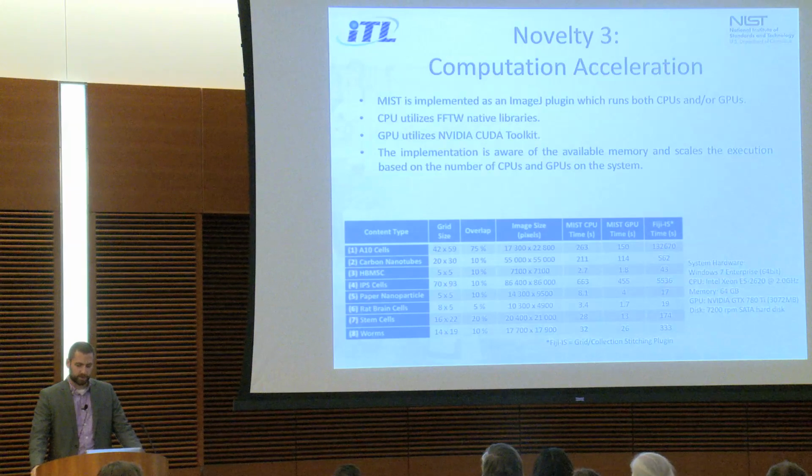To highlight MIST runtimes, I've got 8 datasets shown here with GPU, CPU, and the Fiji grid collection stitching runtimes. The computer used to generate these had a mid-range CPU, mid-range GPU, and the images are stored on a hard disk, not an SSD.